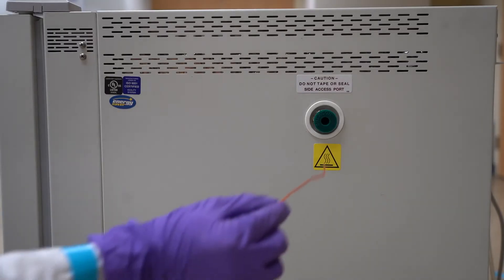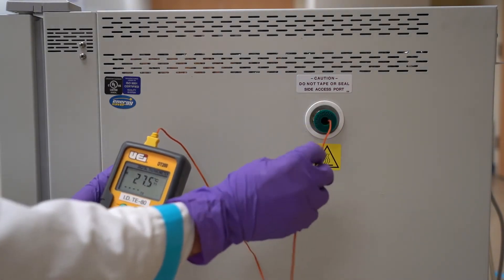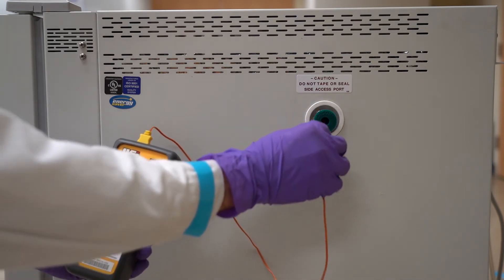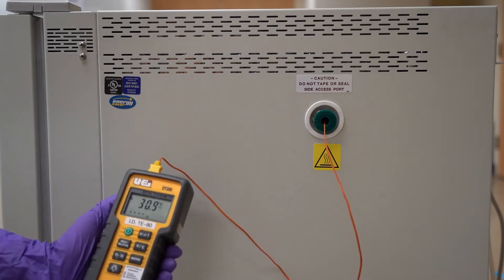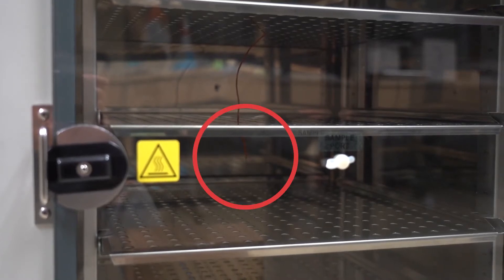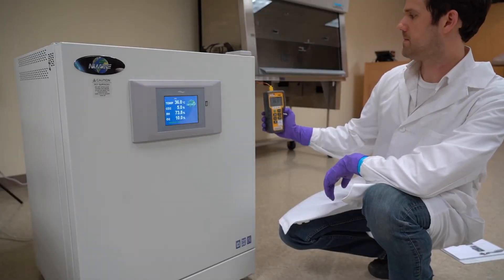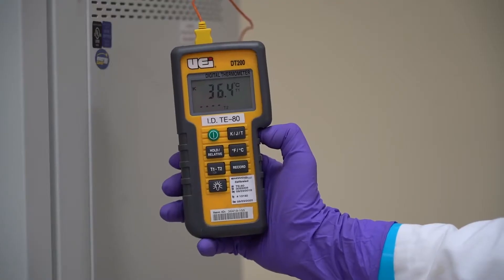Let the incubator stabilize with the door closed for 8 to 12 hours. Route an independent temperature measuring instrument through the side port and into the chamber. Look through the inner glass door and ensure you are measuring from the center of the chamber. Follow the instrument's instructions to take a stable temperature reading.